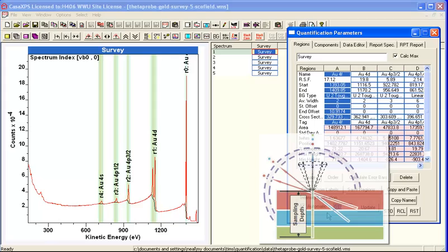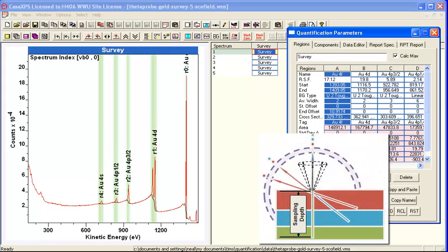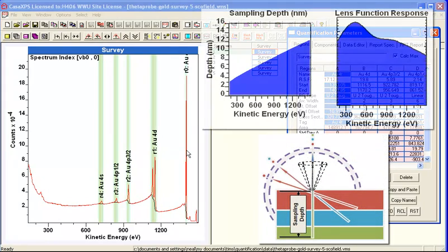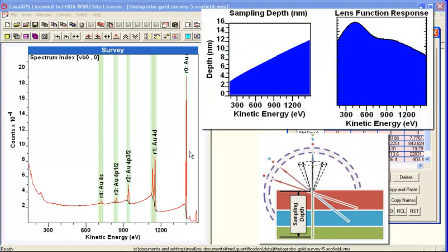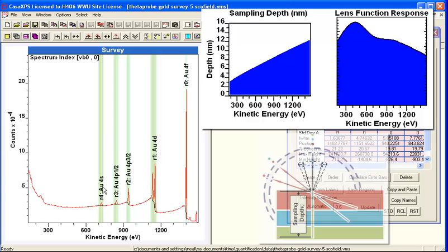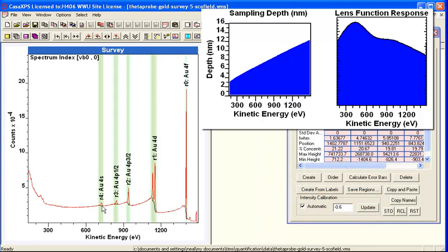So we have to do a correction that this gold 4f peak is representative of electrons that are coming from deeper in the sample than this gold 4s peak.